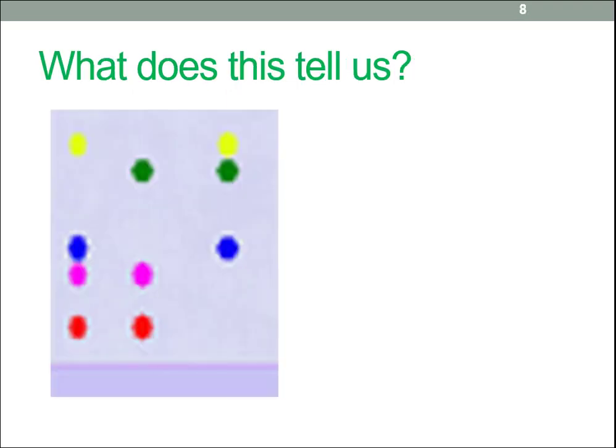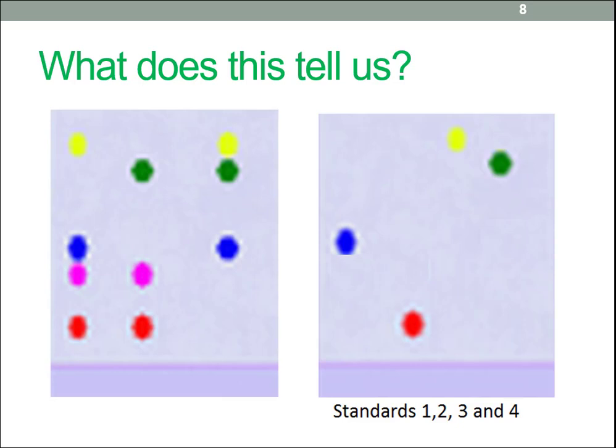This is a typical paper chromatography result. By itself it doesn't mean very much, so we need to use standards. Again, you probably know this from qualitative and quantitative analysis in biochemistry. Analysing proteins, for example, we need examples of known compounds of interest to compare with, what we call standards.